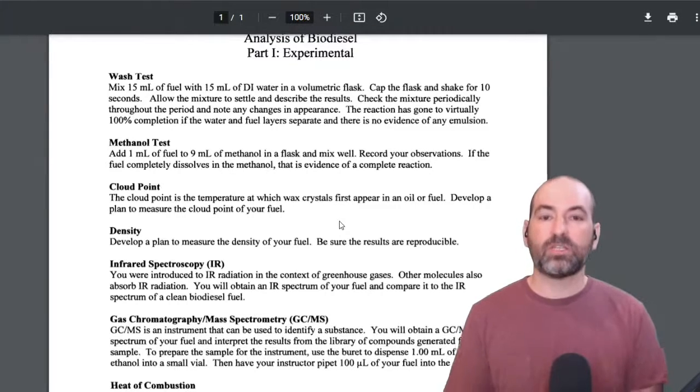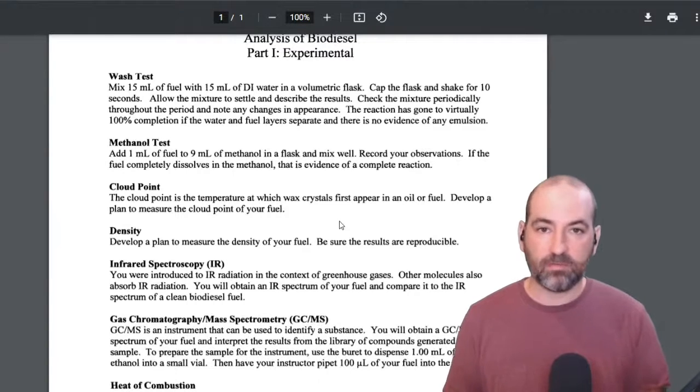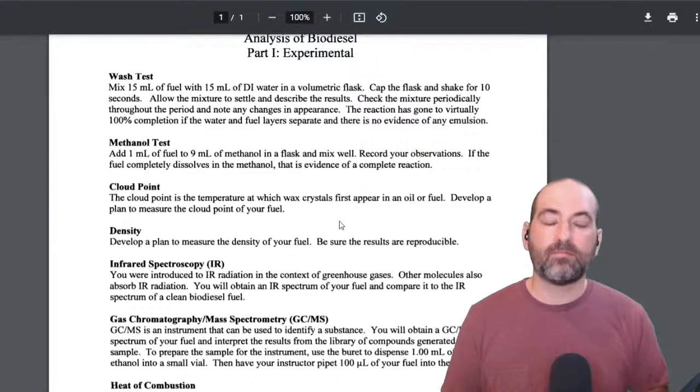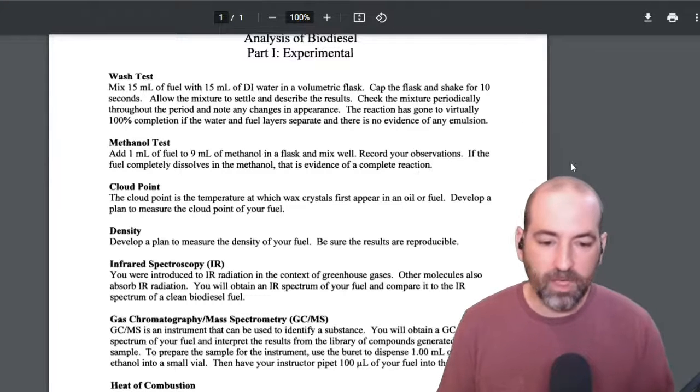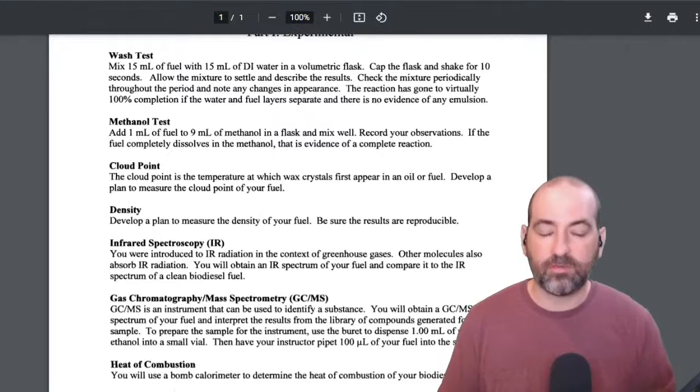It's pretty simple. Essentially, you need the mass of a given volume, and then you divide the mass by the volume. So you measure a milliliter or 2 milliliters or something, and then take the mass of that amount and then divide those two numbers. And you should do it a couple times, maybe a couple different volumes, just to get consistency, make sure you have consistent numbers.